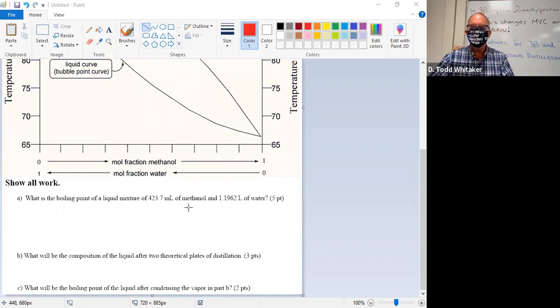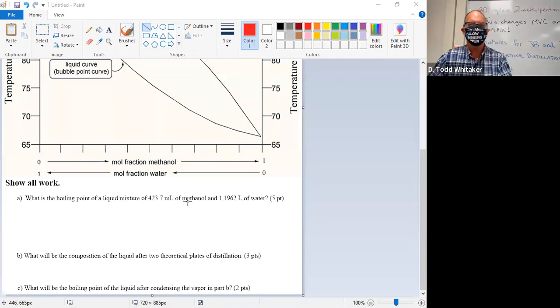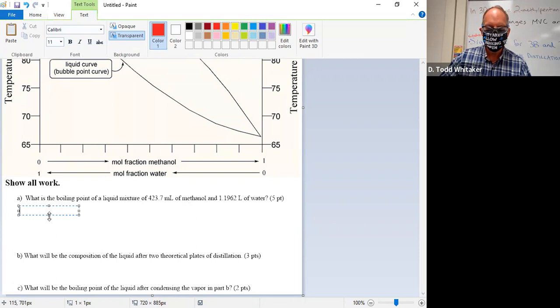What data do I need about methanol? And I need you all to try to find methanol in the red book. And somebody, the first person that finds it, yell out a page number so we can all get on the same page. It's under METH. And while we're waiting, we're going to need the density. And I'll try to type on here. This could be an adventure. Good old typing with paint. 1753 is the page number.